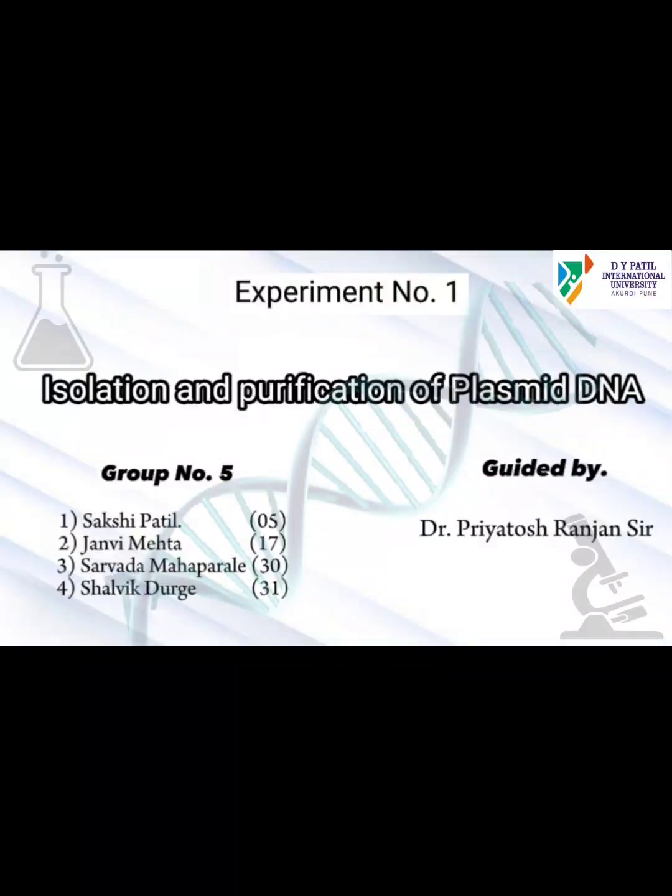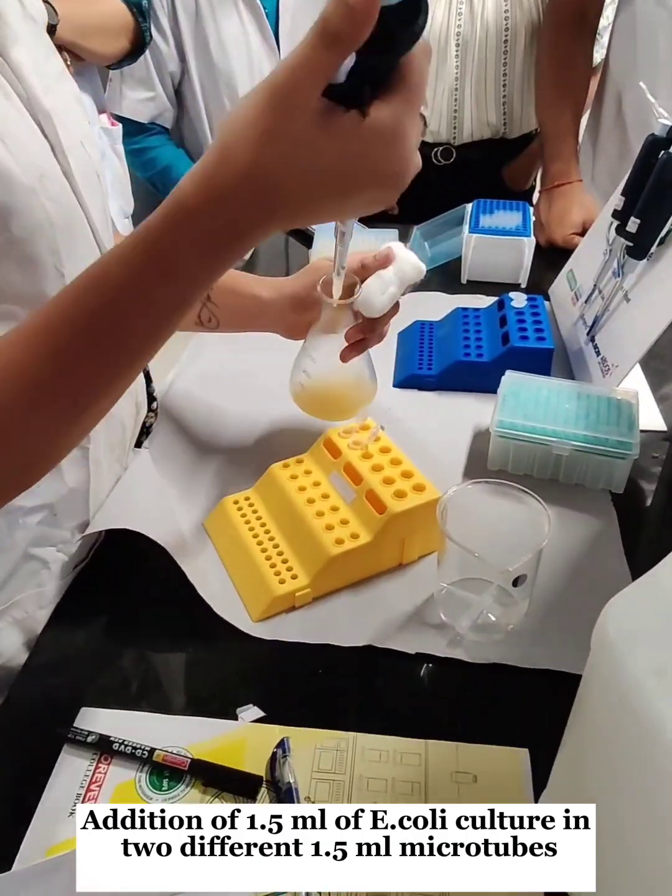We isolated and purified the plasmid DNA using the alkaline lysis method, which involves three buffers: resuspension, denaturation, and neutralizing. To extract the plasmid DNA from the E. coli cell membranes, we took 1.5 ml of culture in two different vials.